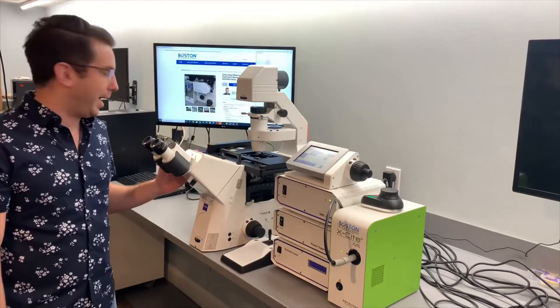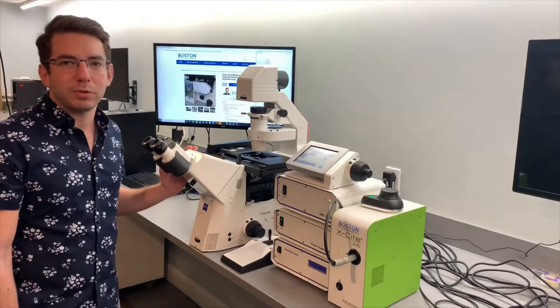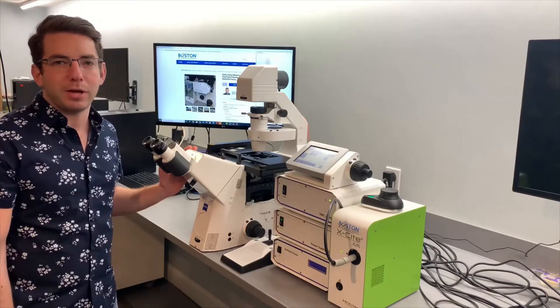This Observer Z1 has a PCO Edge 5.5 SCMOS camera on it and Pat's going to go into a little bit more about the camera and the functionality of the microscope.